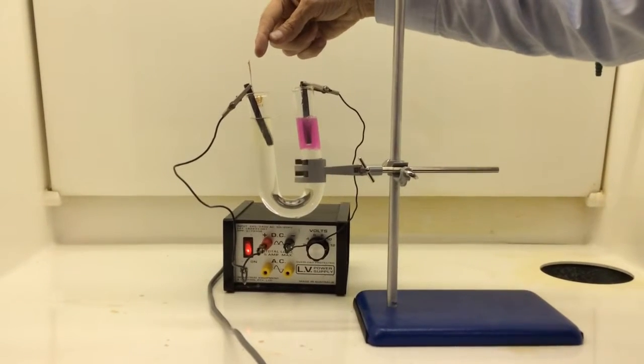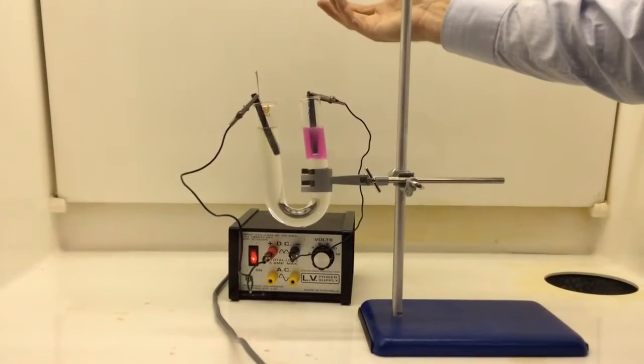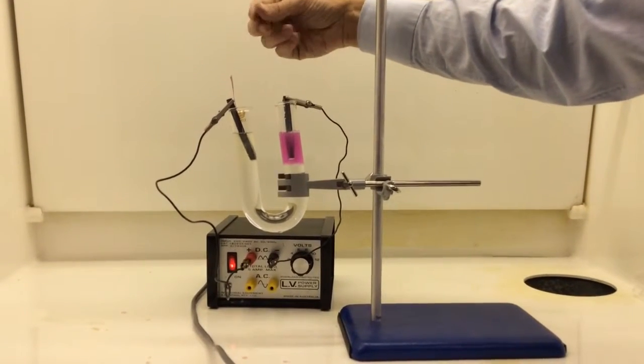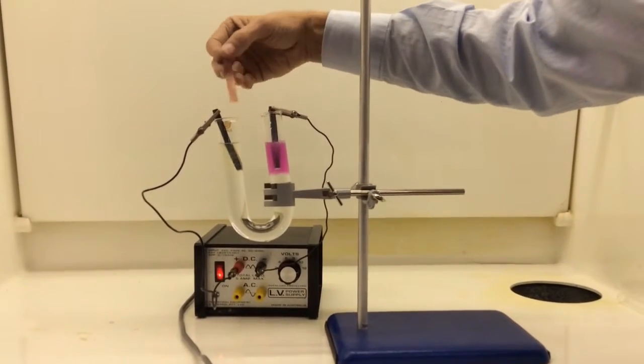What it's going to do to the litmus paper, it's not actually turning blue. There we go, it's just been bleached.